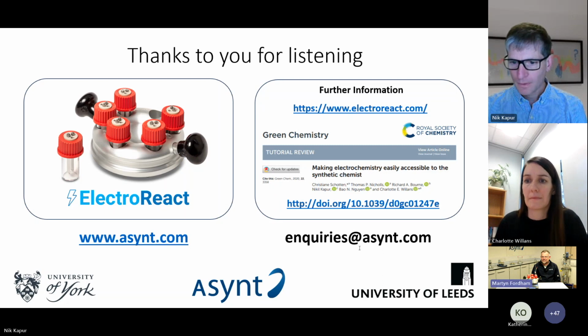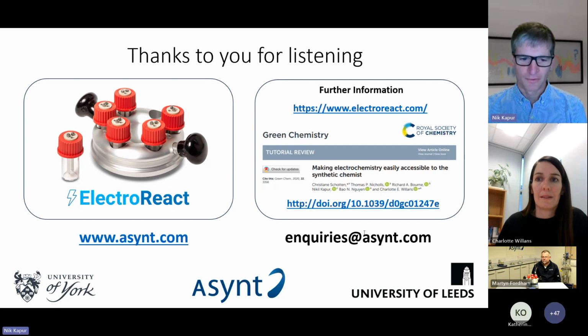With the Electrosyn, we've seen contamination of the reaction mixture with metal coming from the attachment points from the electrodes. Can this be prevented with this setup? I mean, I can answer from a sort of mechanical perspective, Charlotte, but you've more from you. I can start with that.